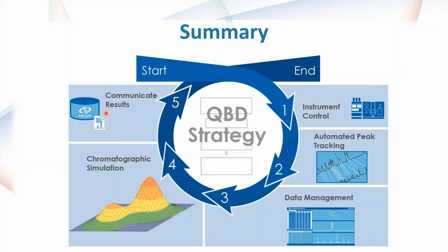Okay. I was going to go into a brief software demonstration just to show you some of the elements that I'm describing here. The part that I was going to go over at the beginning is how somebody would start off by designing a quality by design strategy within the software. And then I'm going to show you an interface where the project is nearly complete. So what we'll see is the data management interface after peak tracking has been done and after instrument control has acquired the data. And then I'll show you how the chromatographic simulation interacts with the data management interface.